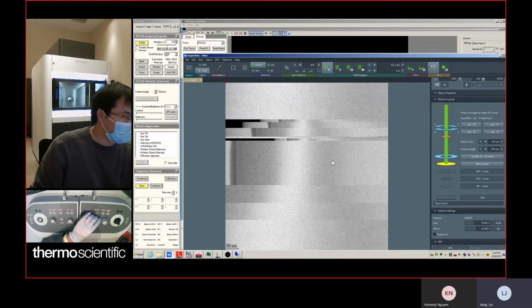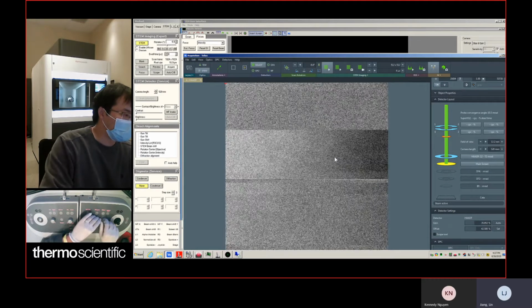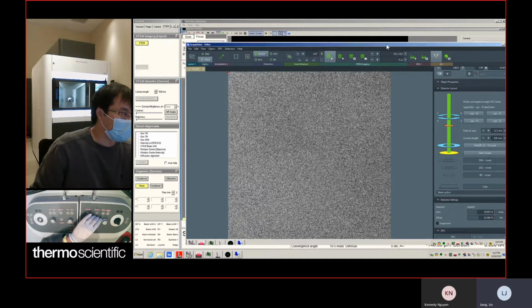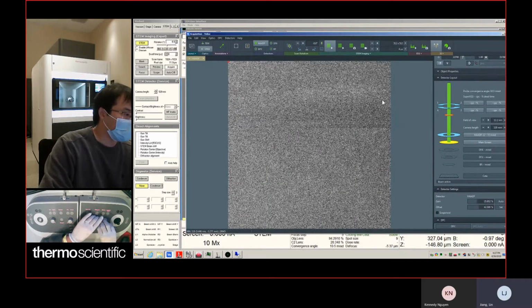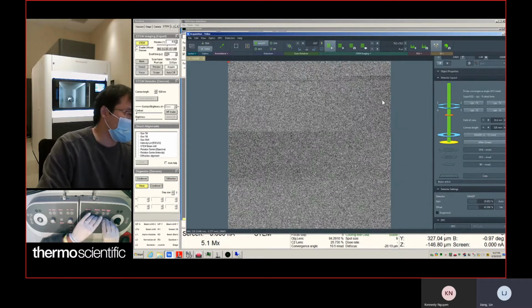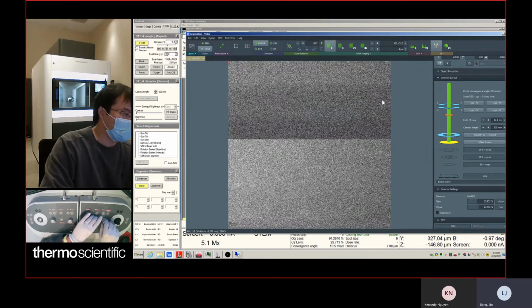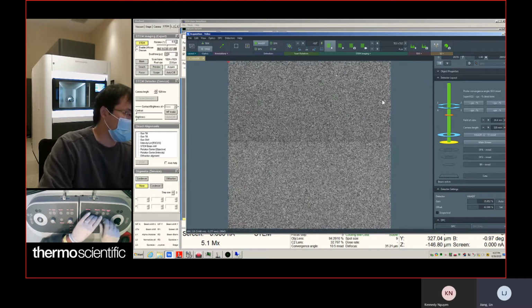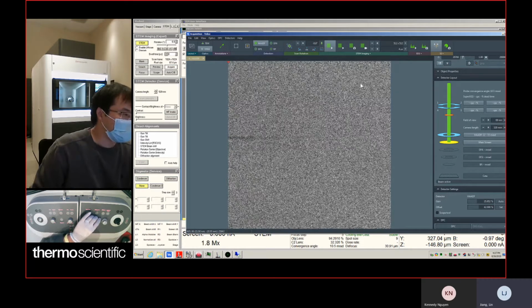Always use HRF. So I would say right now the camera length is too large. It's hard to form atomic resolution imaging. So in order to see that, probably you need to lower the camera length.